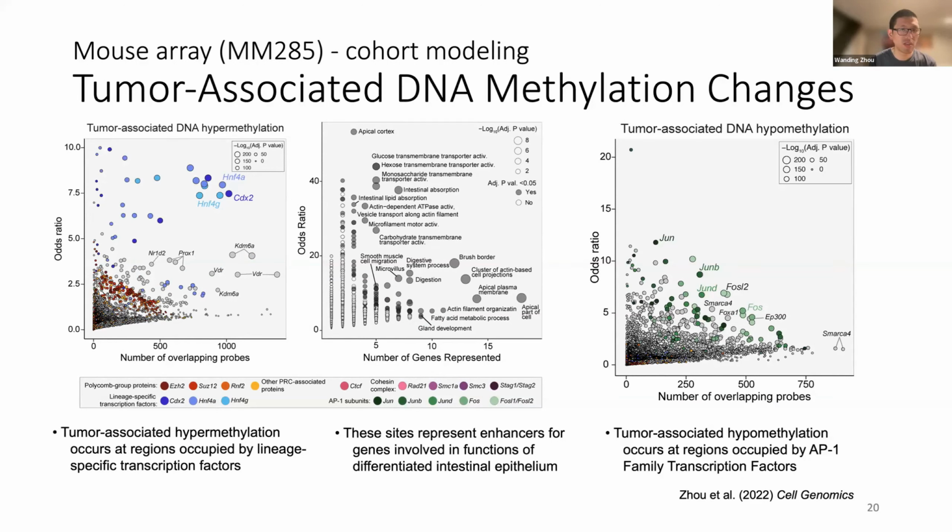In this case, intestinal tumor, so it's mostly intestinal cells, the colon or intestinal mucosal cells.